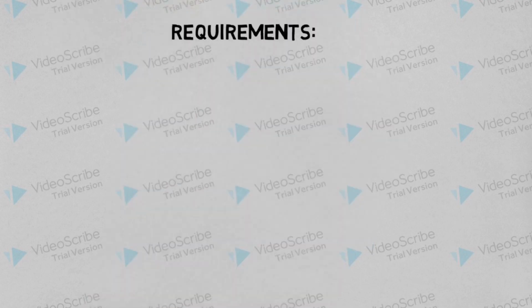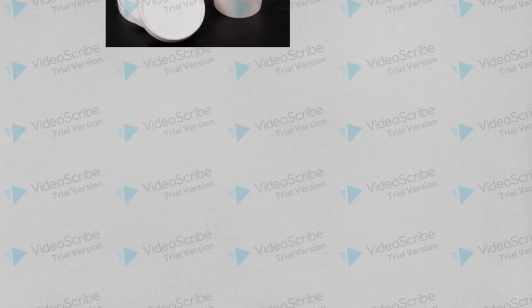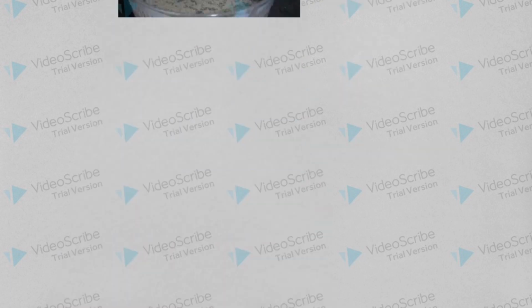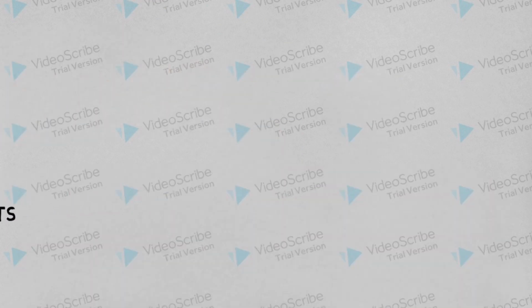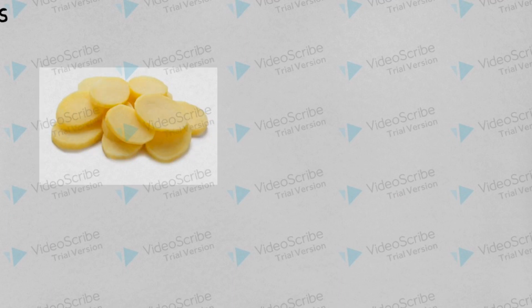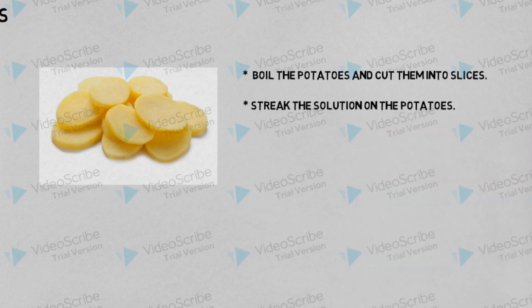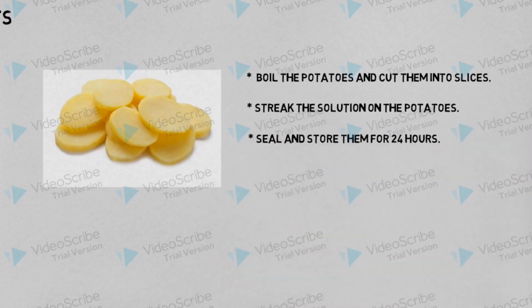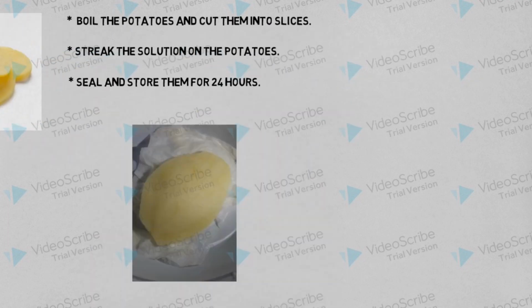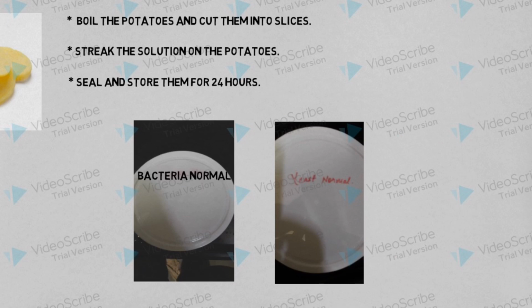So in this experiment, we will require boiled potatoes, plastic bowls, syringe, yogurt stock solution, yeast stock solution, and many more basic microbial equipment. In the first part, we boil the potatoes and cut them into slices, setting them aside to cool. Next, we streak the bacterial and yeast stock solutions on the potato and store them, sealing it up for the next 24 hours. We also keep a potato control for proving a hypothesis, which we'll observe after 24 hours.